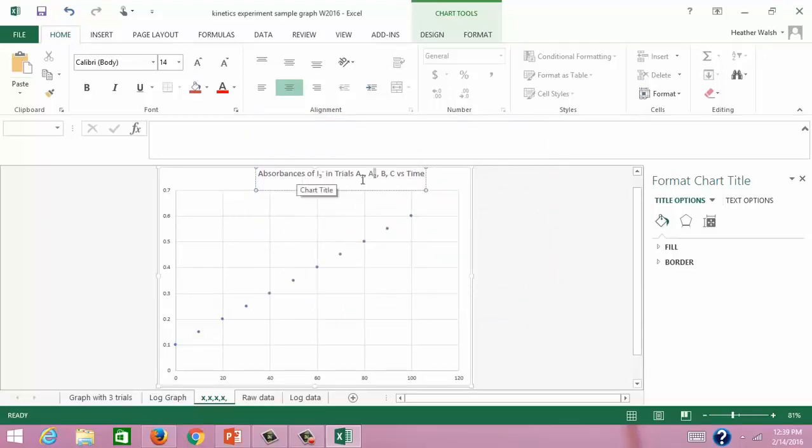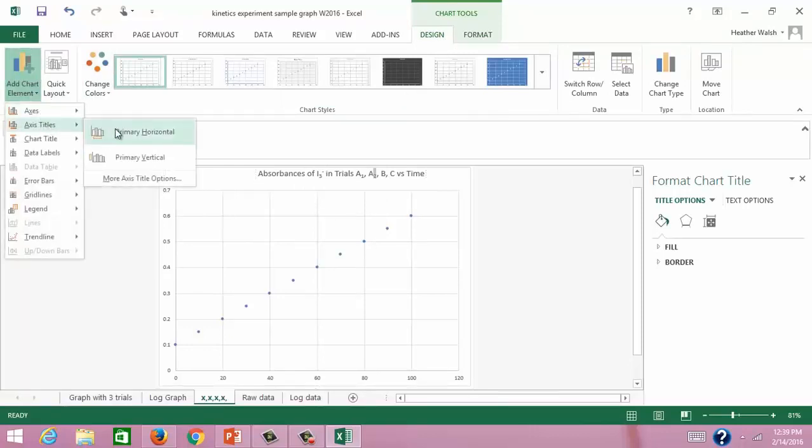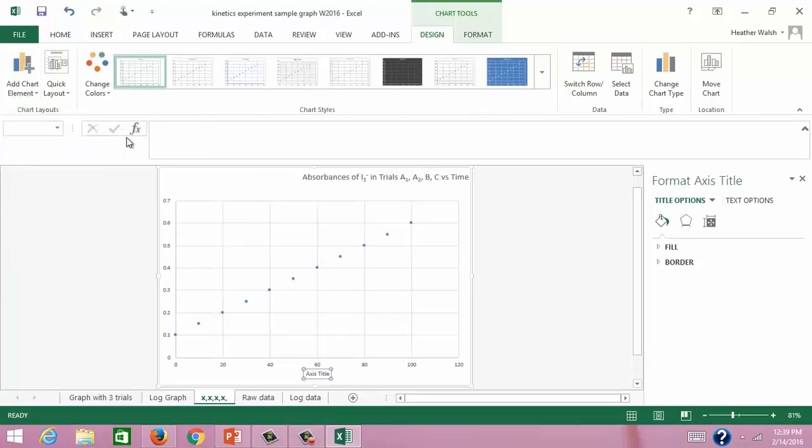It's always the y-axis versus the x-axis. Now, I'm going to go back to formatting or designing my graph. I want to insert a chart element, and so I want to make sure that I am labeling the axes. So here with my axis title, I can say I am measuring time, and then I want to put in parentheses my units. I've also made sure that I have capitalized my axis title. I'm going to move my graph title back here a little bit because it's not centered.